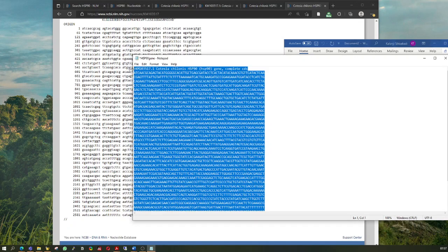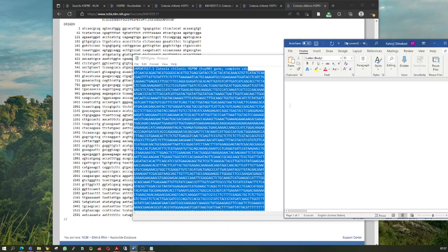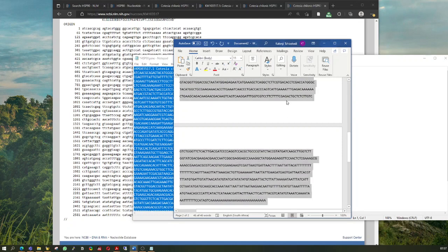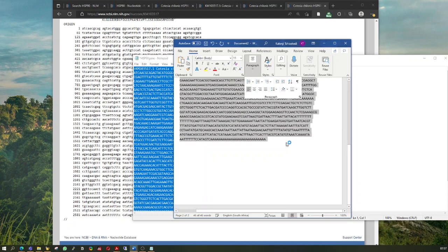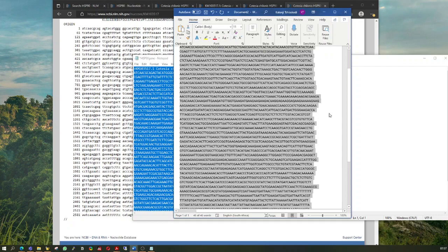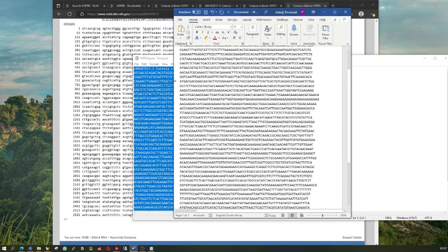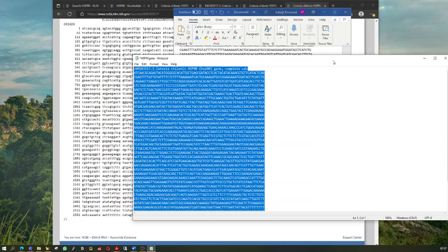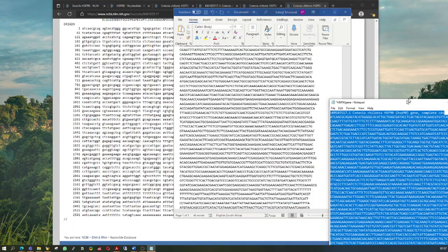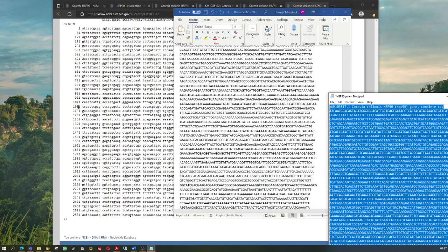If you'd like to create primers, I'm going to take these values and bring them here, and I'll paste it here. Alright, I have my file here. If I want to create primers, because we don't really have time with this recording, I have class straight after this which I need to prepare for, but you can do it in your own time.